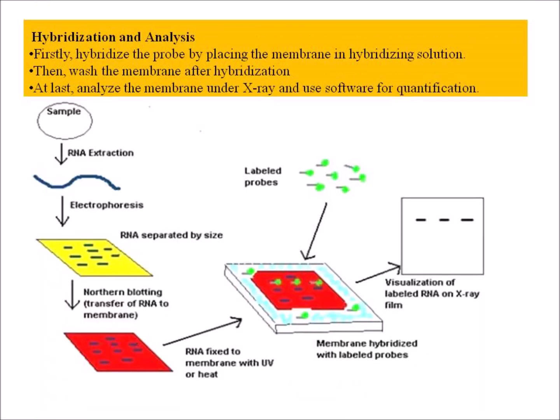Hybridization and analysis. Hybridize the probe by placing the membrane in hybridizing solution. Then wash the membrane after hybridization. Finally, analyze the membrane under X-ray and use software for quantification.